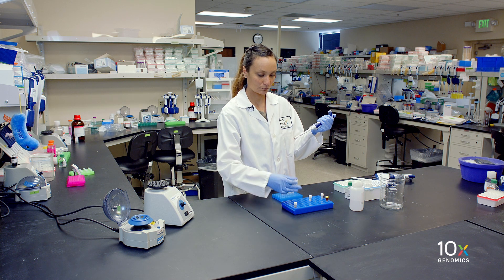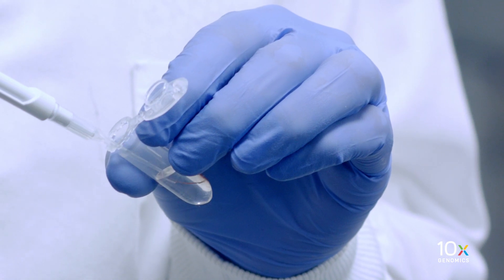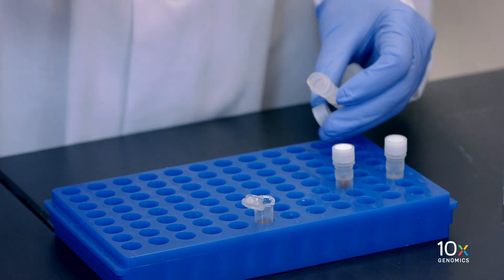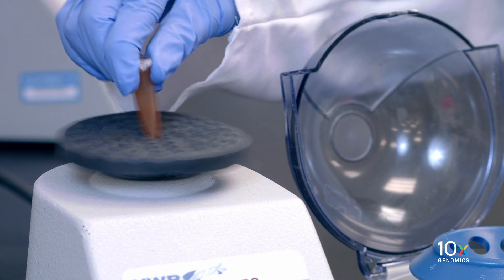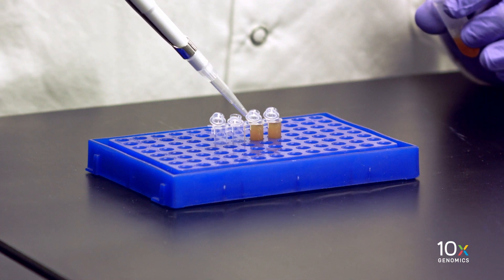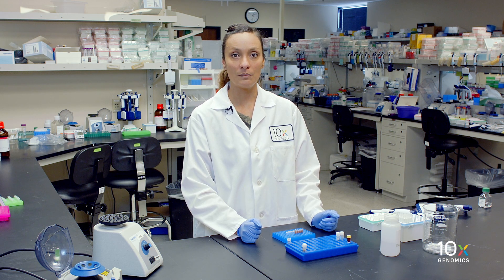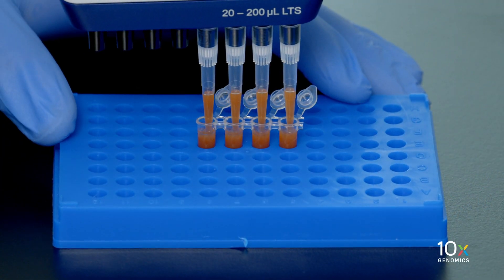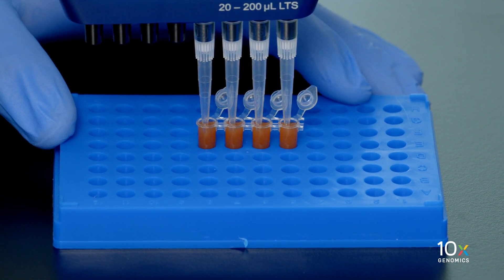We add the thoroughly vortexed DynaBeads, reducing agent B, and nuclease-free water, then vortex mix thoroughly. We immediately add 200 µL of DynaBead cleanup mix to each sample. If the mix has been sitting for any period of time, be sure to vortex it again before adding it to each sample. We pipette mix 10 times with the pipette set to 200 µL, then incubate at room temperature for 10 minutes.